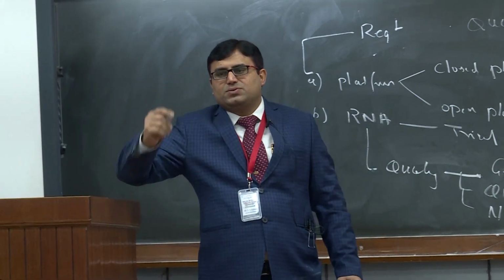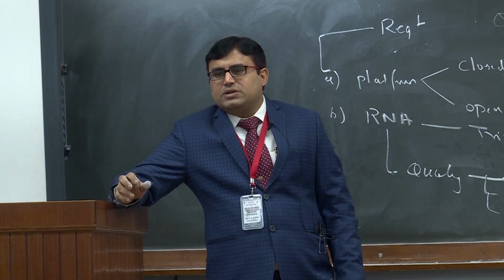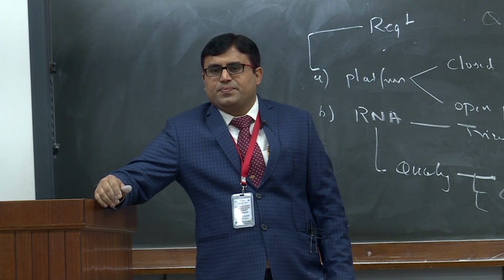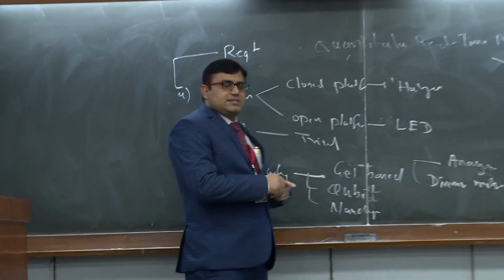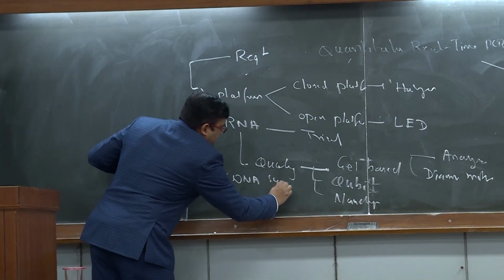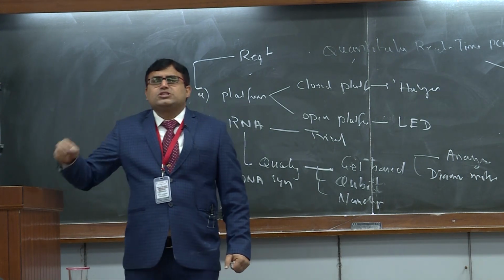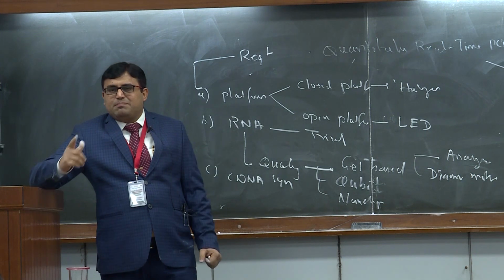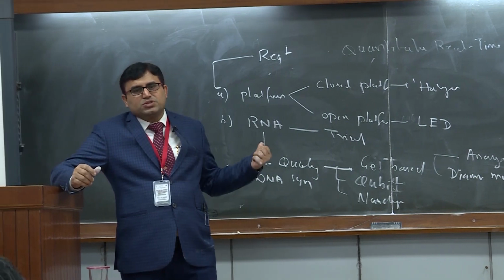Right? This is capillary based, so there is a small capillary tube and there you are going to put one drop of your nucleic acid and it will travel, and based on that they are going to characterize, right? So once you analyze the quality of the RNA, next is cDNA synthesis. The most critical part in case of real-time PCR is cDNA only, because if your template is not good, you cannot expect a correct result. So this is the most critical part.